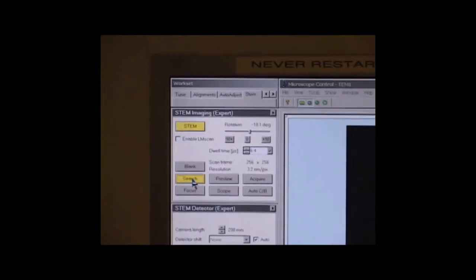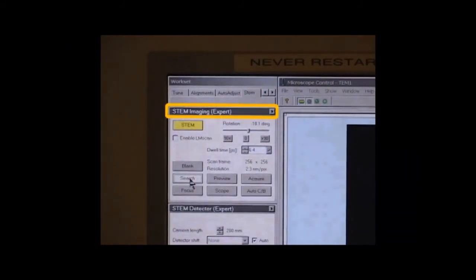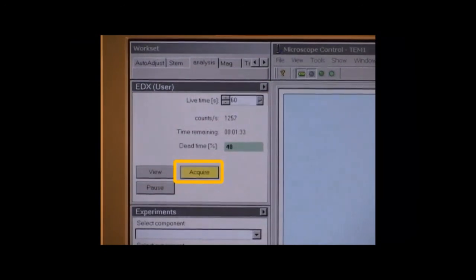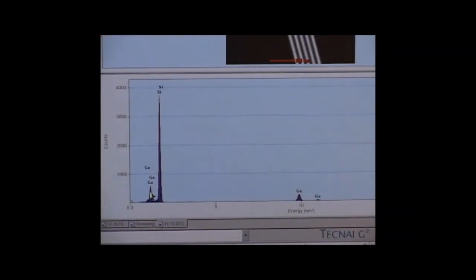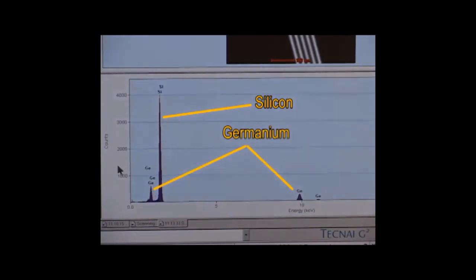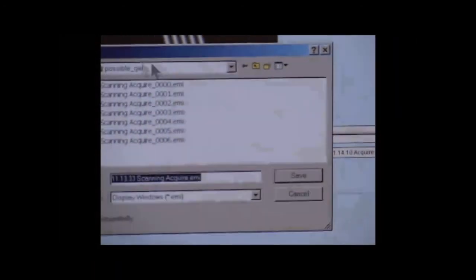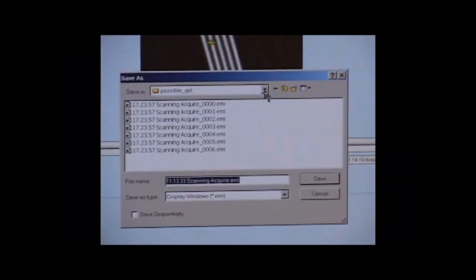We can do EDX in TEM mode, but in STEM, since the beam is focused to a probe diameter about 1 nanometer, we can better locate the position for analysis. In the Microscope Control, click STEM, STEM Imaging, and Search. Locate an area that has the feature you want to analyze. Under Microscope Control, Analysis, EDX User, click Acquire. The energy spectrum reveals peaks for silicon and germanium. To save the EDX data, click the disk icon on the right of the screen. Locate a directory and save the EMI file.